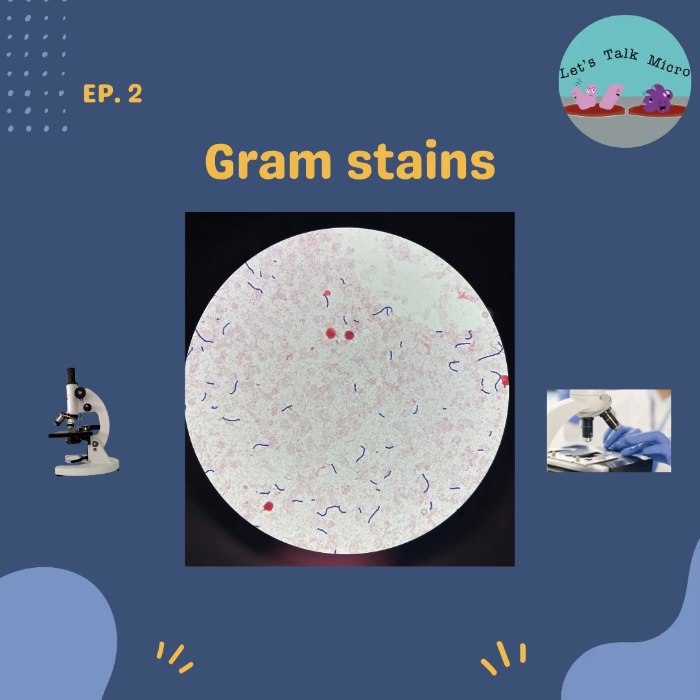A lot of times, depending on the condition of the patient, you put that gram stain out there and the doctor might start the treatment. So if you end up reporting the wrong bacteria, the patient might end up getting the wrong treatment. And this is very serious business. We have to make sure that we do quality work because we are aiding the provider so much with our work. So we have to make sure that we do the correct work. And then you have your counter stain, which is your safranin, which is a red, and that's what gives the bacteria that pink color.